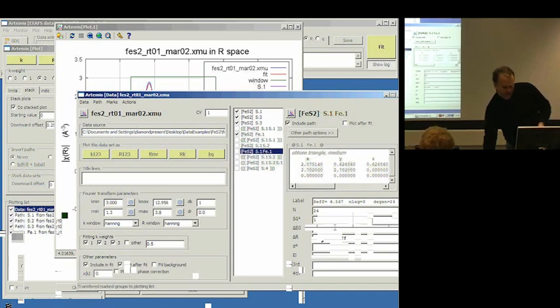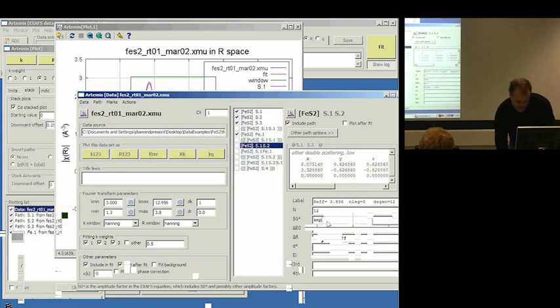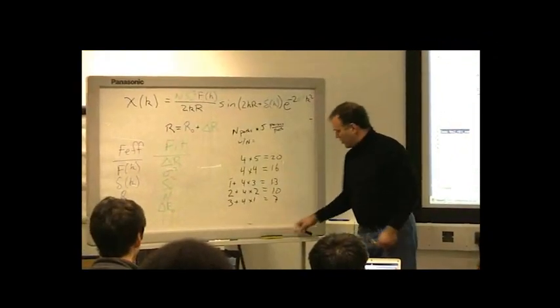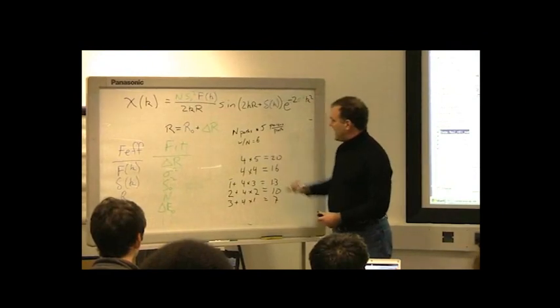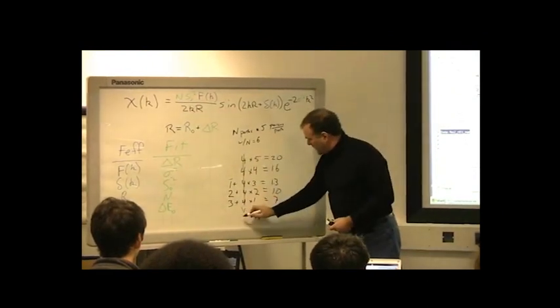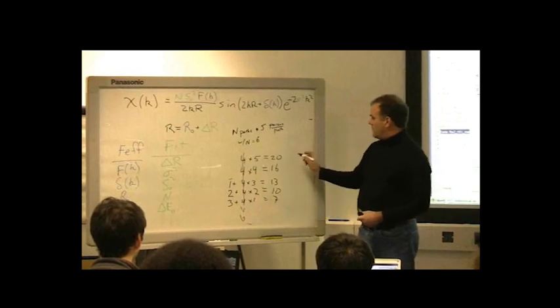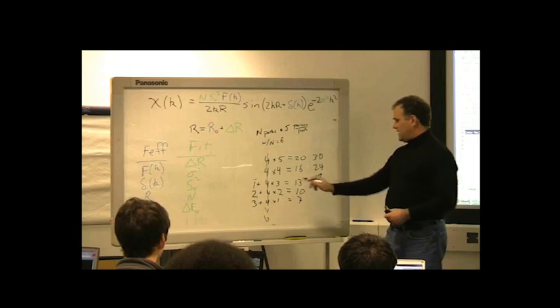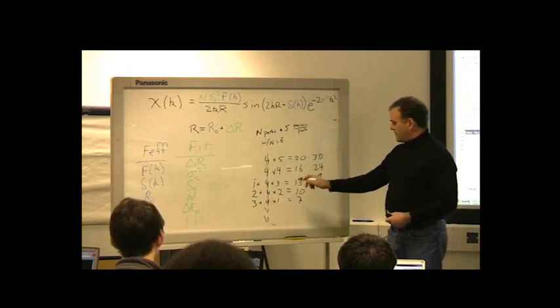Somehow they didn't get, I guess I never pushed these out, so let me give them the correct value of amp. So both of these single scattering paths, we've now made the problem worse, in the sense that the original problem would appear worse, in the sense that this is 6, so all of these become 6, this becomes 30, this becomes 24, 19, 6 times 2, 14, and 11.